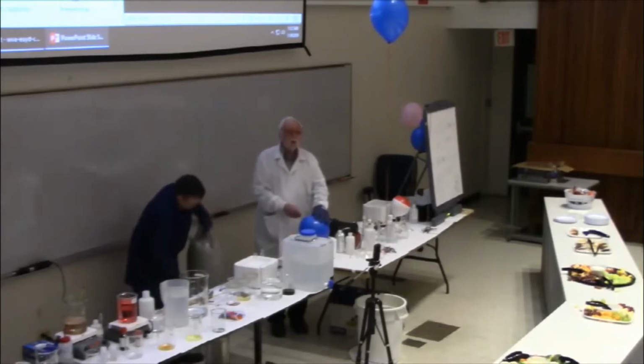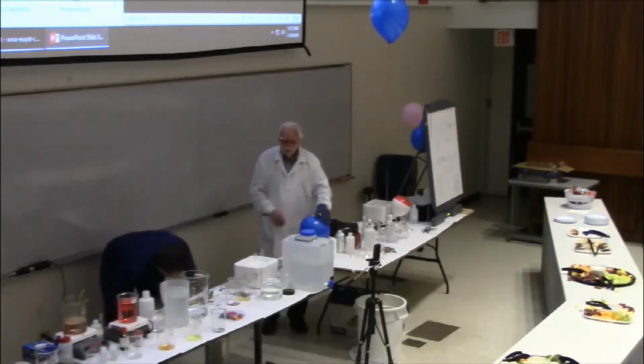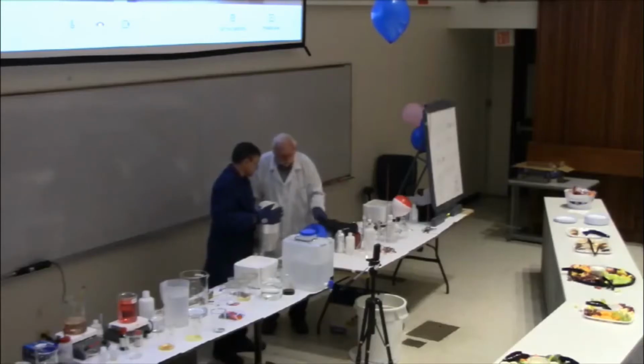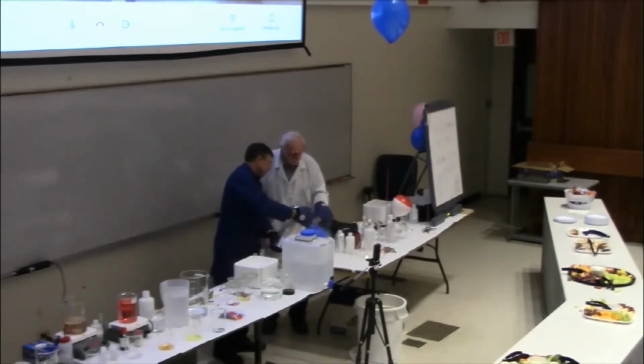Incidentally, this is liquid nitrogen. I'd like to put the glove on. No bare hands. We'll be in trouble.